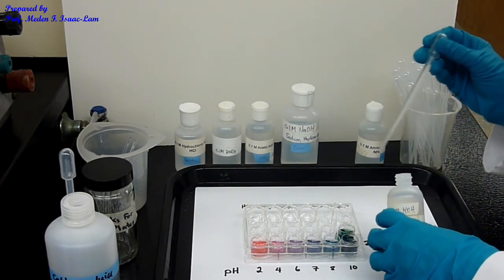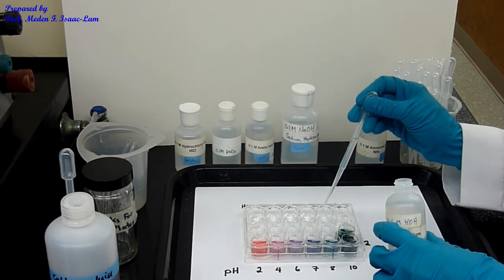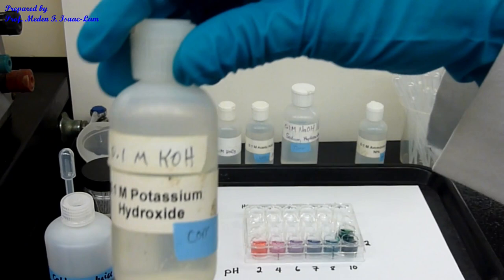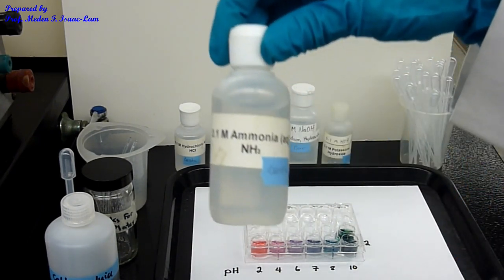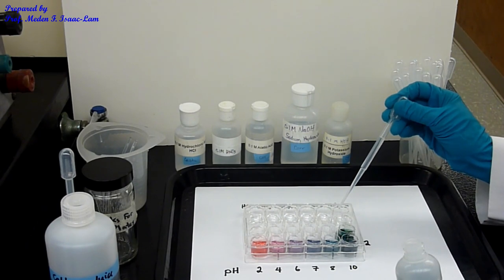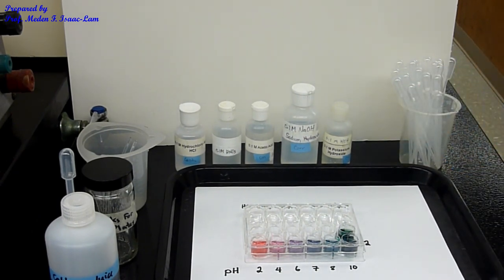20 drops. And the last one is ammonium hydroxide. This is KOH. And this is the last one, which is the ammonia in water. Aqueous ammonia is ammonium hydroxide. Same. Okay, so those are our six solutions.